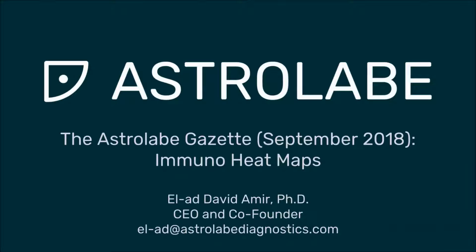I record this video to give you a brief demo of the new immunophenotyping heat maps that are now available through the Cell Subset Navigator.